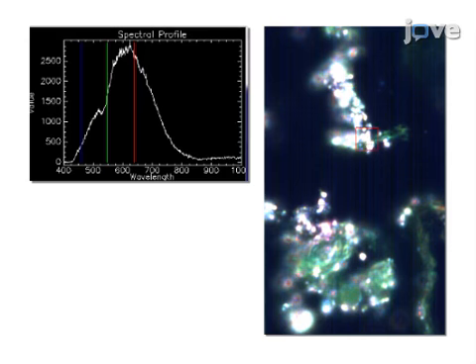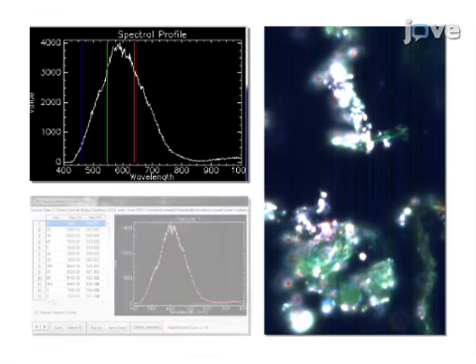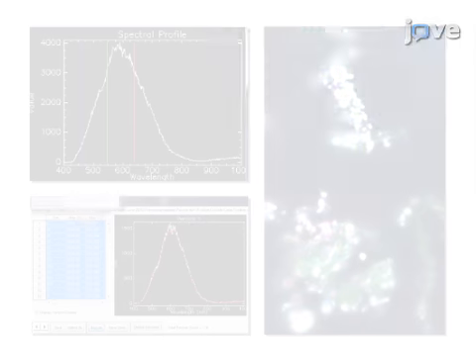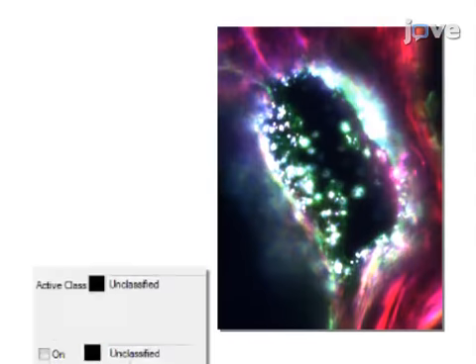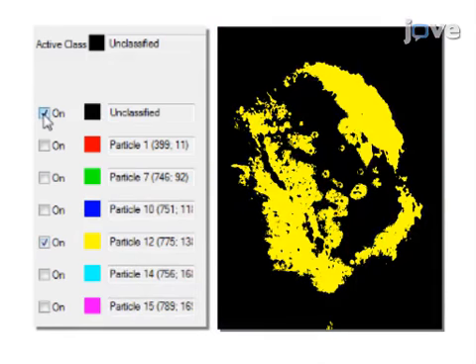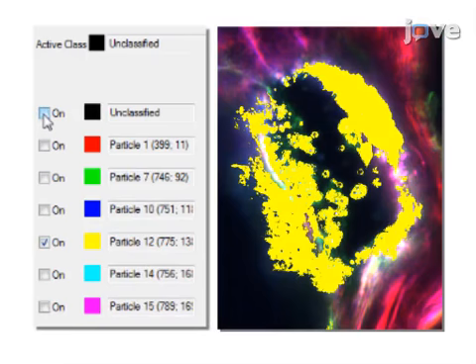Next, a reference spectral library is created from the positive control data cube, which is filtered against a negative control to remove any false positives. The final step is to use the reference spectral library to map against experimental samples to identify and locate nanoparticles of the same composition.